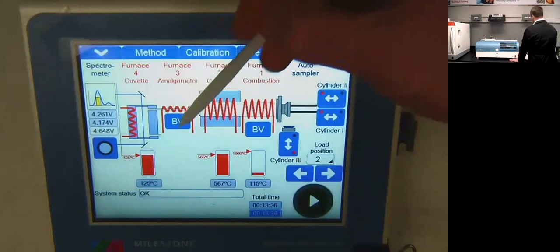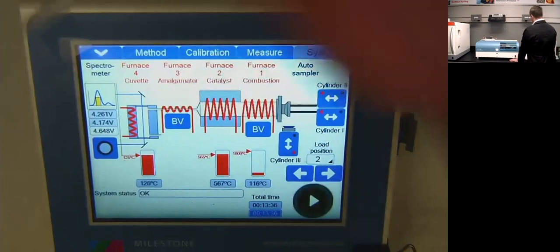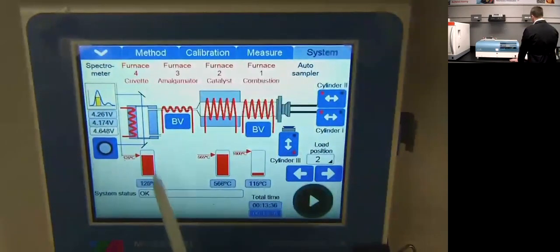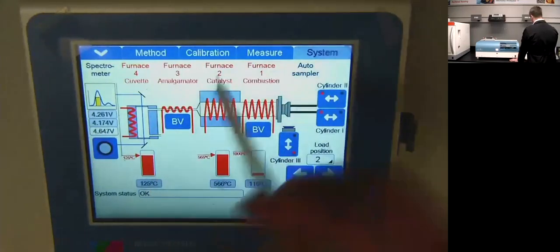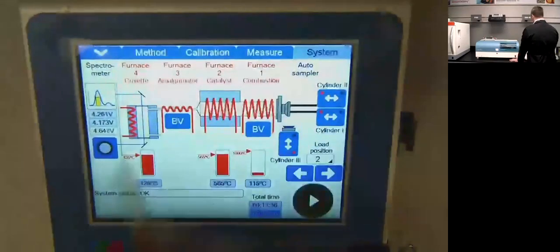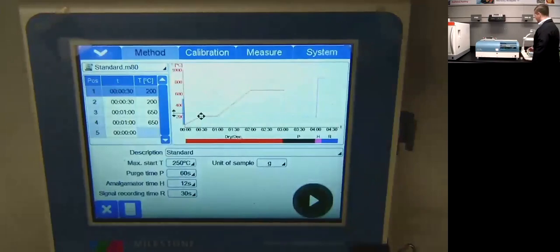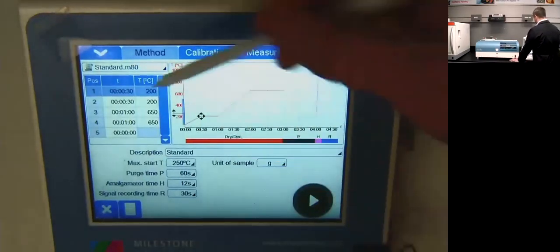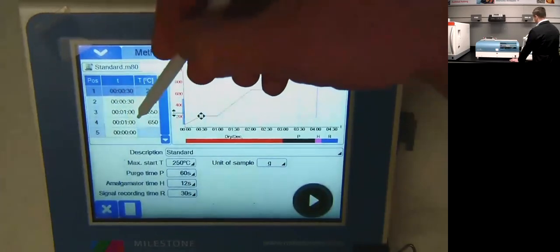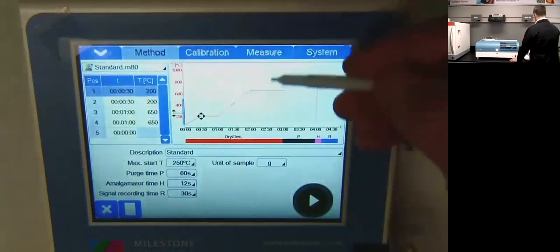The amalgamator is a gold coil that amalgamates the mercury, then heats up to 850°C to volatize the mercury into our cuvette — our AA detector — which is always kept at 125°C to stop moisture condensation from aqueous samples. To run the system, you start left to right like a book. This is our standard M80 method, referenced in EPA method 7473 — direct combustion and amalgamation of mercury. It's a 30-second ramp to 200°C to drive off moisture, a 30-second hold, a one-minute ramp to 650°C, and a one-minute hold at 650°C where all the mercury comes out.